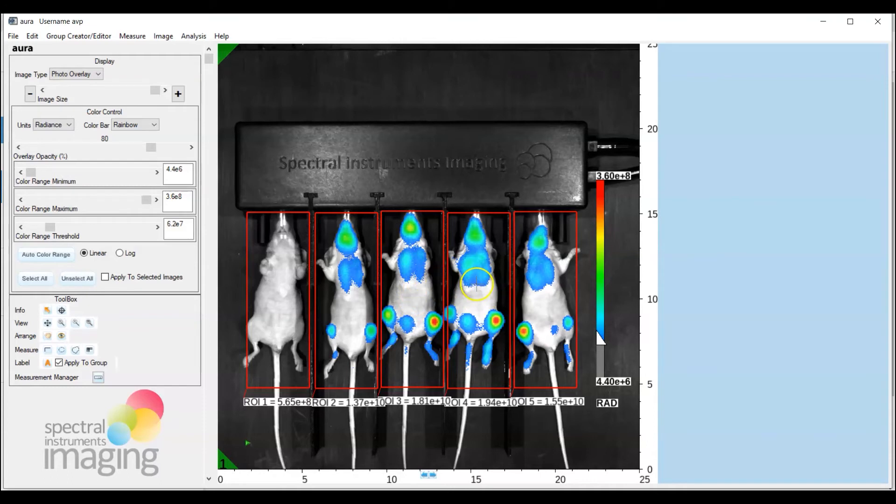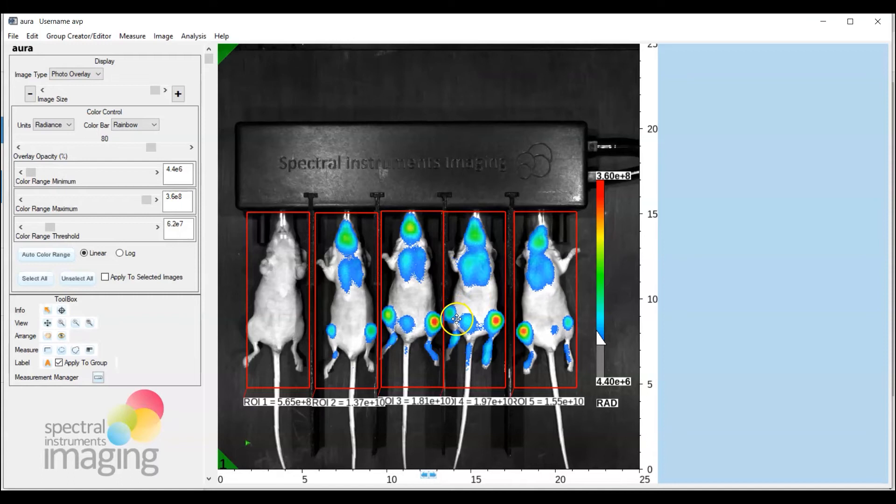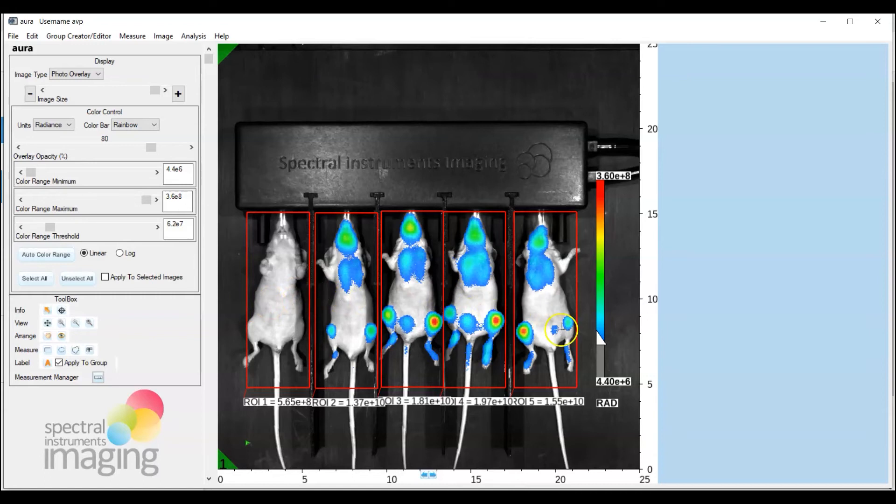All right and you can fine tune this to get all the ROIs into exact position to capture all of the signal from any one mouse so I'm going to modify the position of this particular ROI a bit. Fine so now what we have is the whole mouse ROIs drawn for the control mouse and the four test mice.